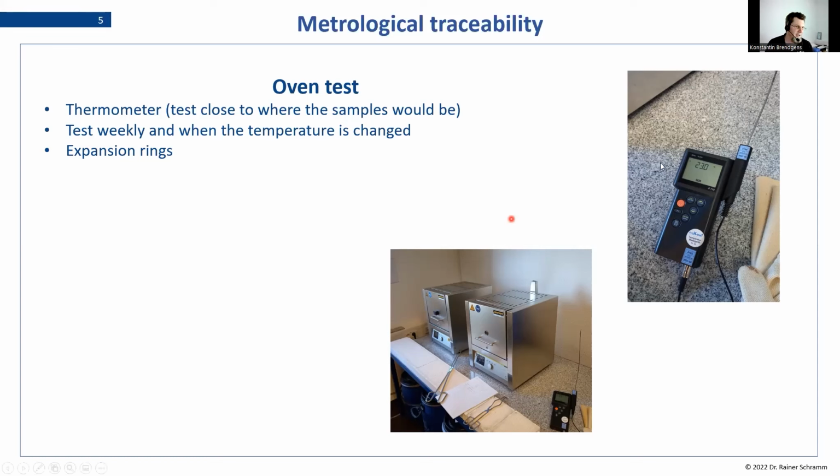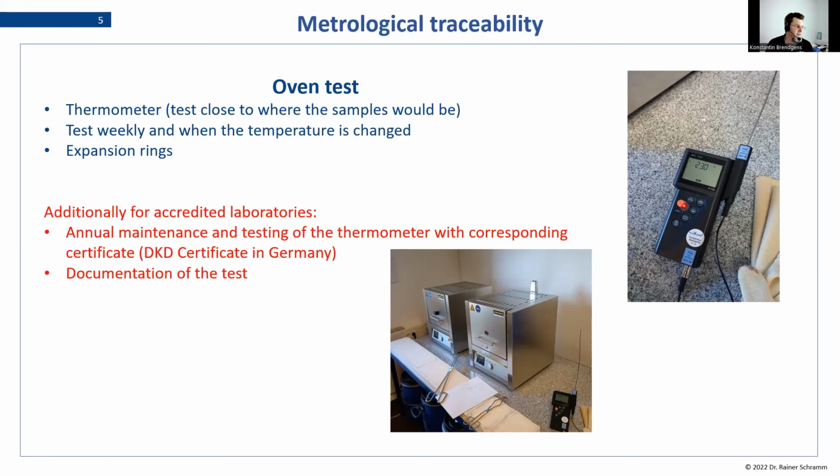But I think these thermometers are more present nowadays, and so they're the way to go. Again, for the accreditation laboratory, since this is your testing device, you have to get the same certificate. As I mentioned, this one we send away. That's why we have two.